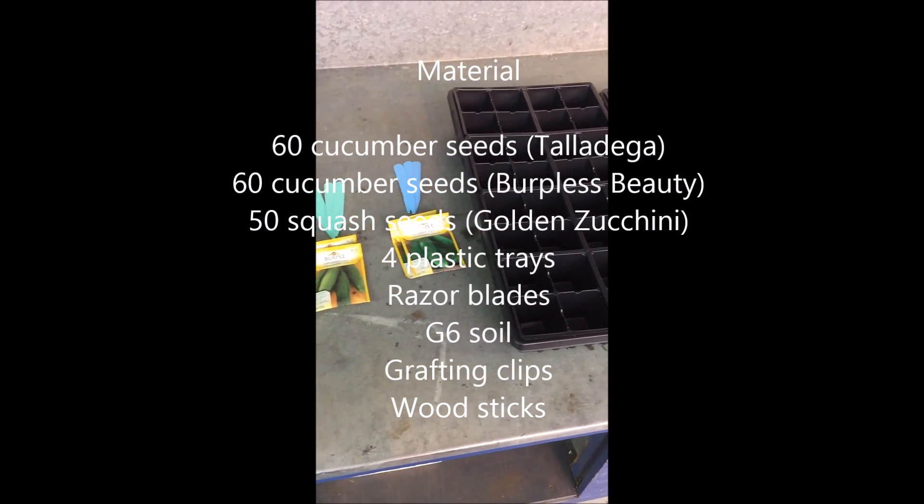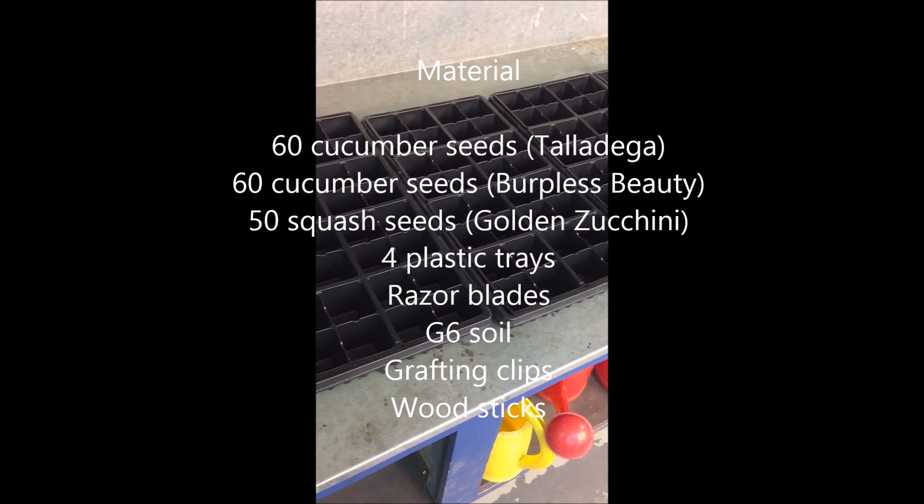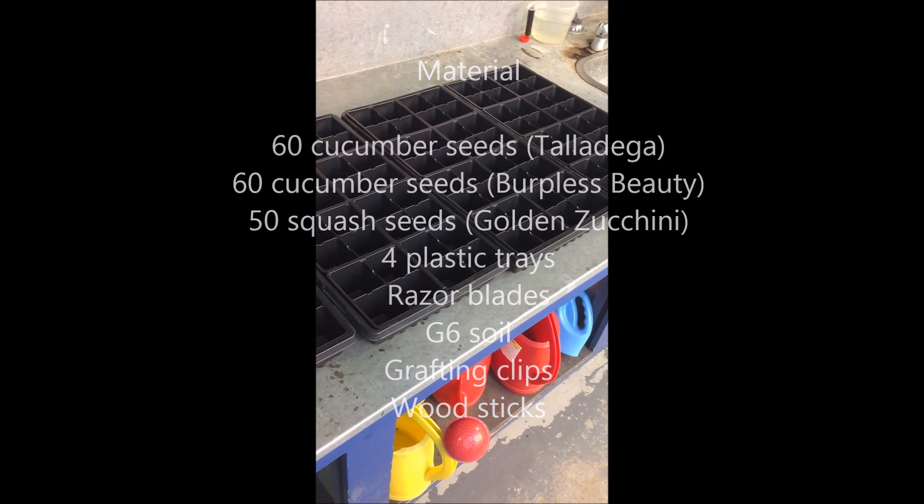The material required is the cucurbit seeds, four plastic trays, a razor blade, G6 soil, grafting clips, and wood sticks.